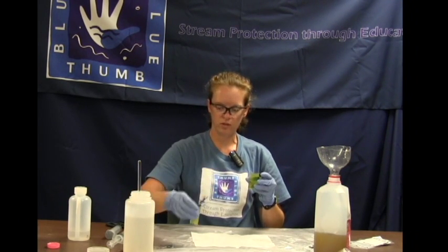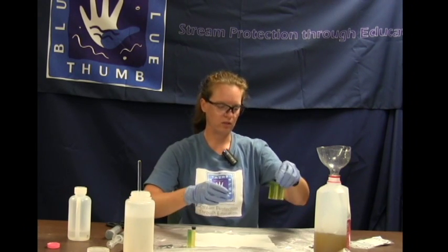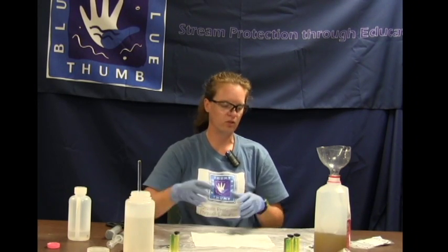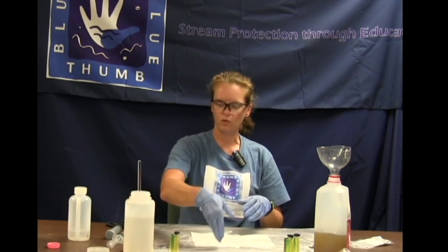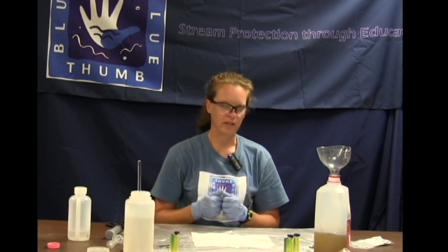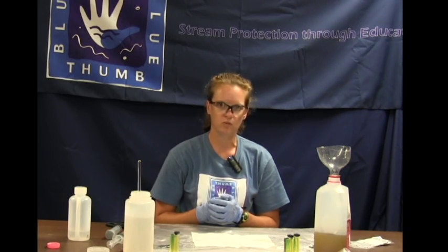Now we're going to time this for 15 minutes, 1-5. And whenever I'm doing my creek water tests, I have the 2 creek waters on one side, the blank on another, just so I know which one is which. Some people write down blank and 1 and 2 on their data sheet or on their paper towel, something like that. So whatever works for you, and we'll wait 15 minutes and see what happens.